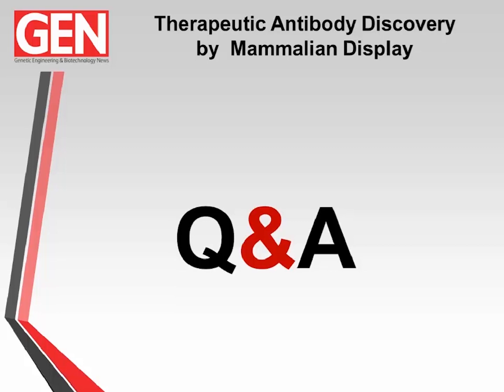John, another question for you. One of our audience members would like to know, how are the antibodies tethered to the cell surface, and can this be switched to produce secreted IgG? Yeah, so the original system as we built it uses a PDGFR transmembrane domain, so the antibodies are tethered in that way.